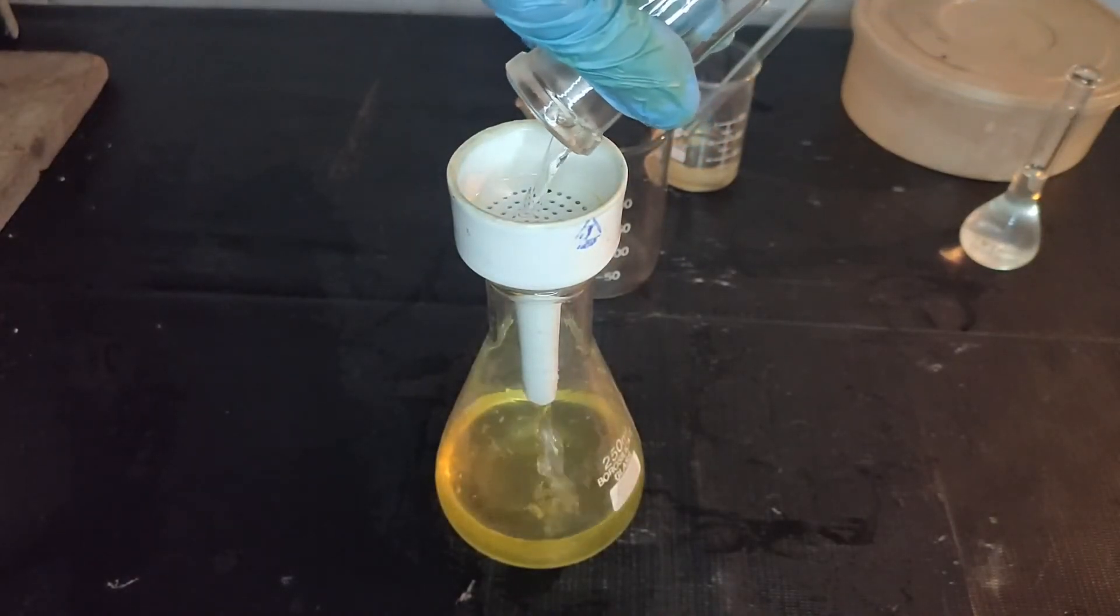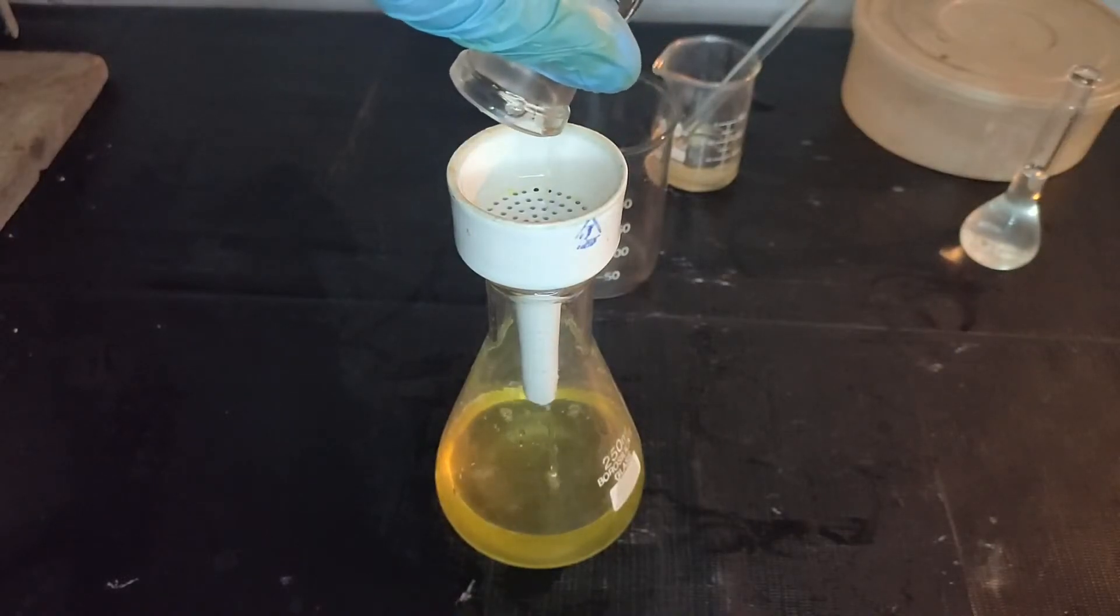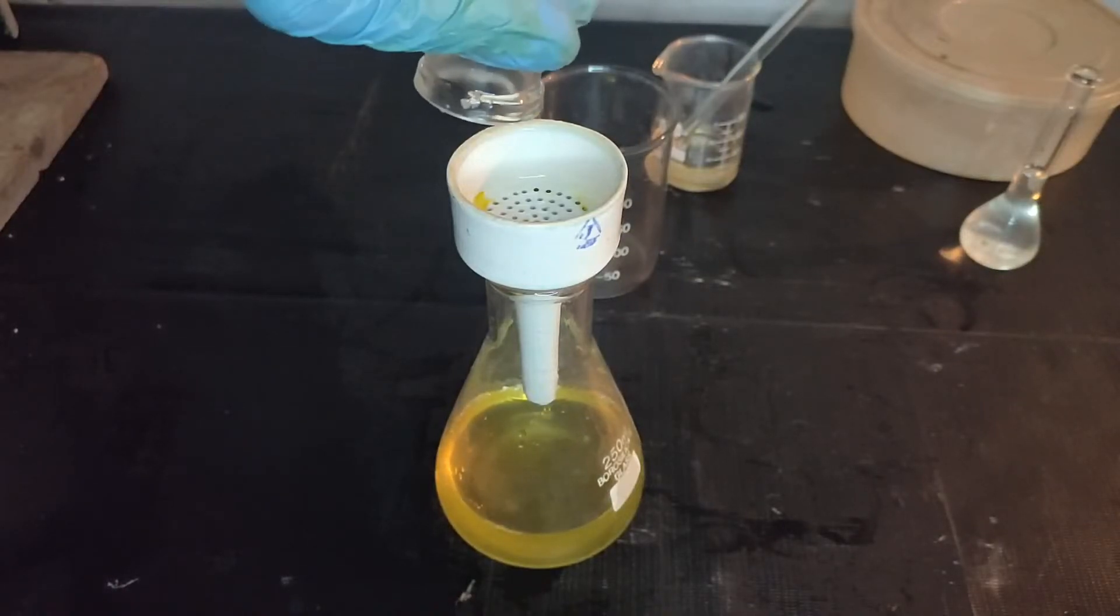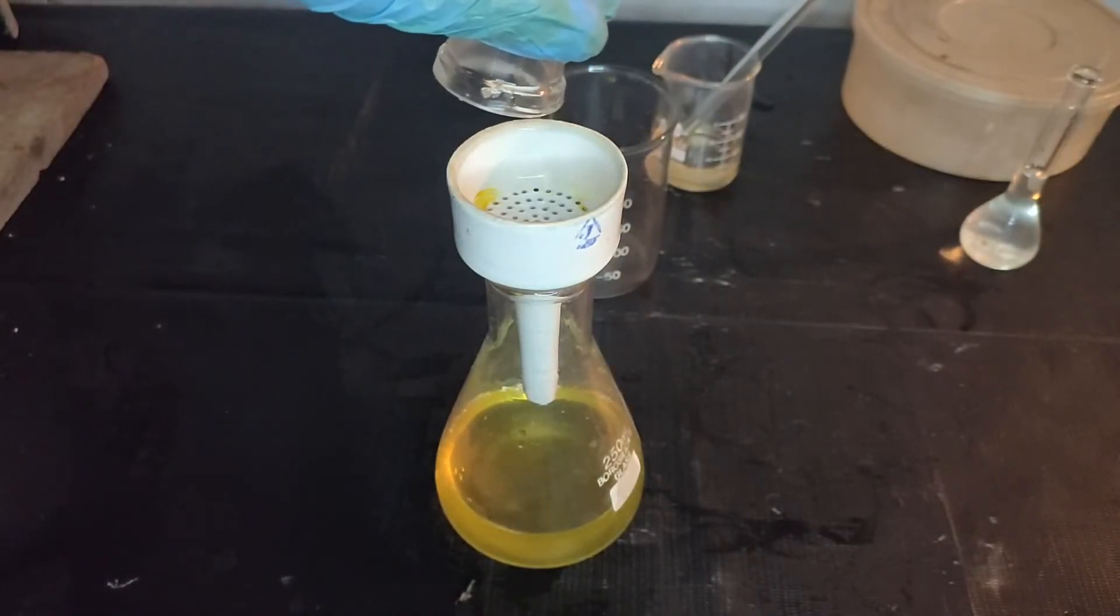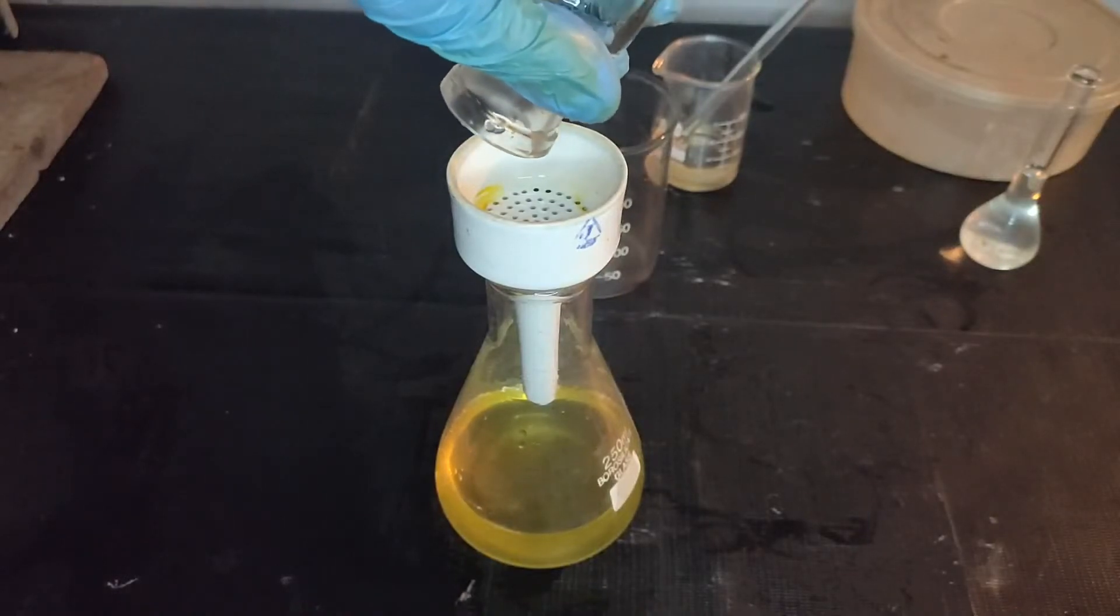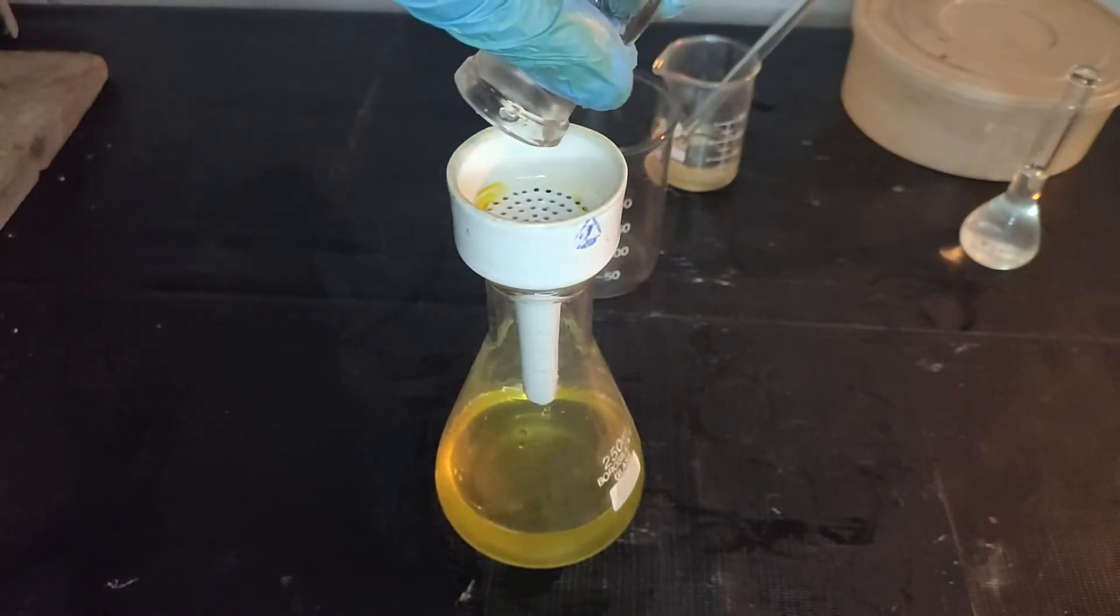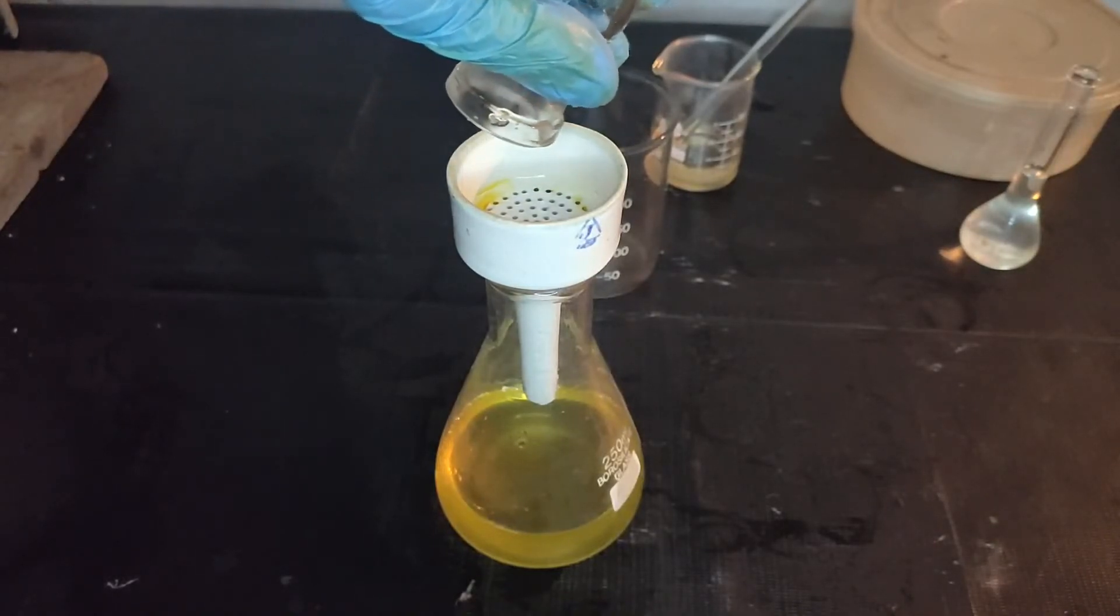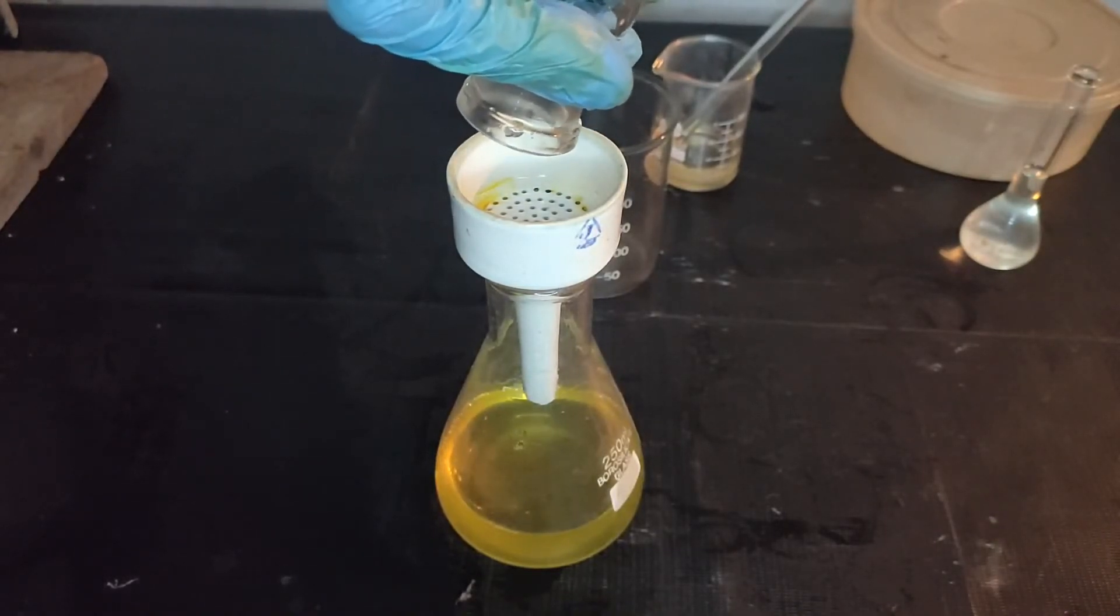So the conclusion is, I wouldn't recommend anyone to distill concentrated sulfuric acid. It's better to buy lab grade 98% sulfuric acid rather than distilling the drain cleaning one. I needed 98% sulfuric acid for some synthesis which are water sensitive, and drain cleaner sulfuric acid can't be used like in the synthesis of chromyl chloride.